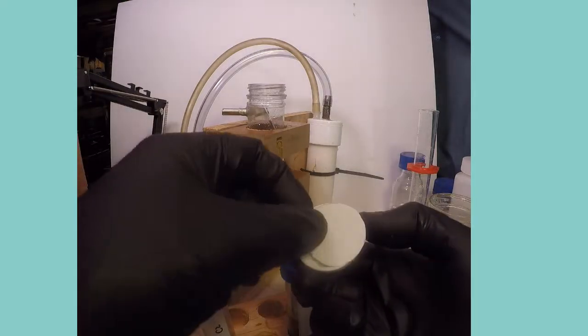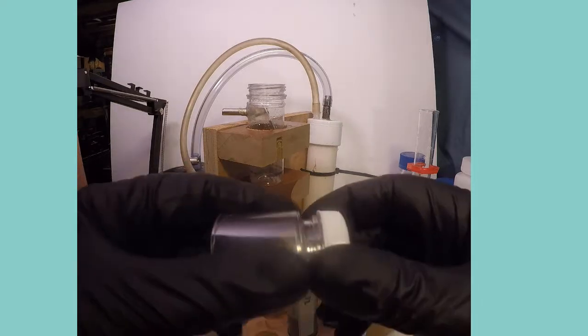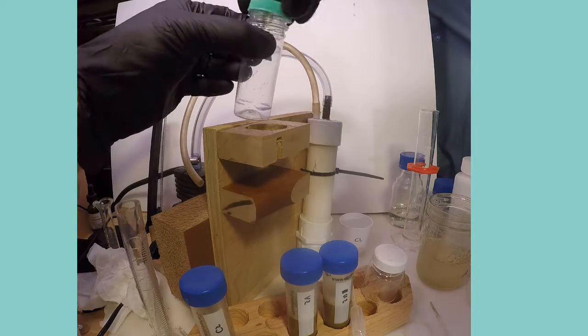The extract can also be filtered quite quickly using vacuum filtration with a rig like that shown here, made using a modified car tire air compressor.